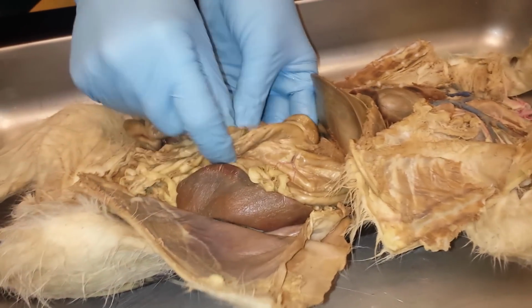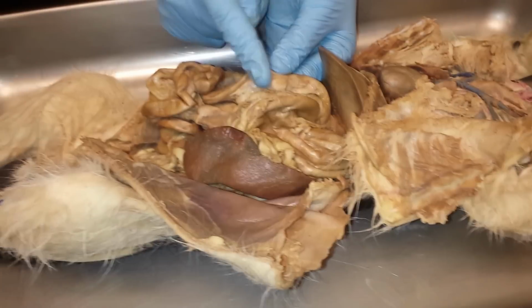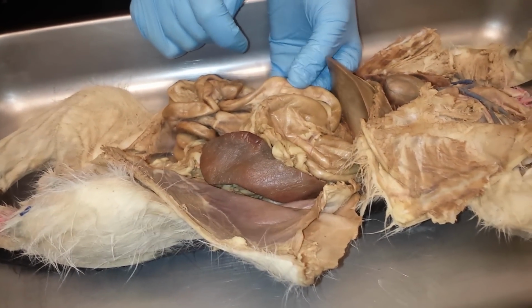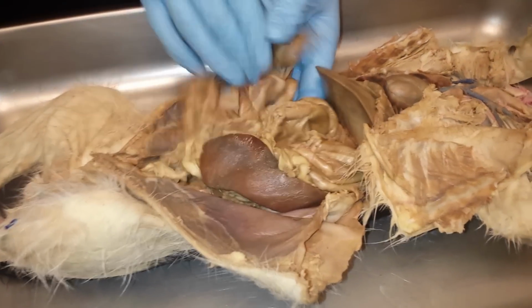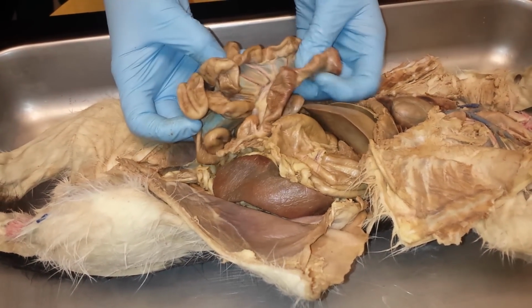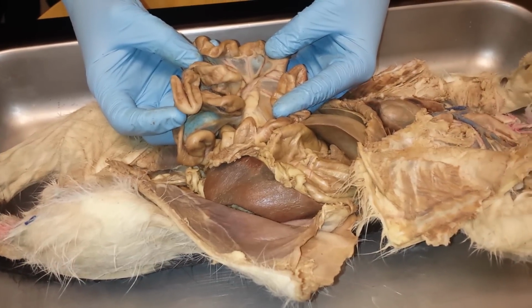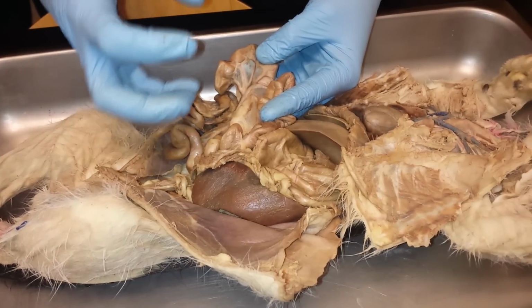Coming directly off of the stomach, you'll see the small intestine. So if I have a pin in the small intestine right off of the stomach, duodenum, okay? Because it's closest to the stomach. So this is the duodenum. And if you look in the mesentery, all of this stuff that looks kind of spider web-like, you'll see arteries and veins embedded in it. Right here, arteries, veins, nerves. That's all mesentery.